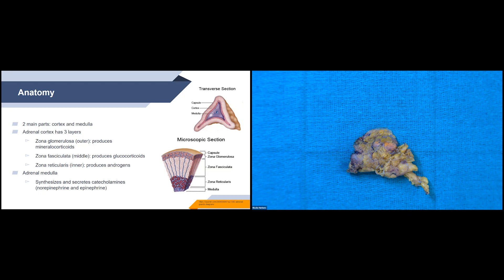The innermost layer of the adrenal gland is the medulla, which is typically more of a red-brown color. The adrenal medulla synthesizes and secretes catecholamines.